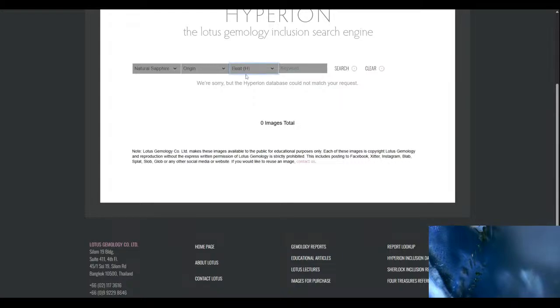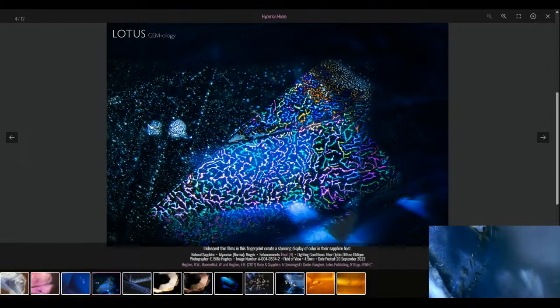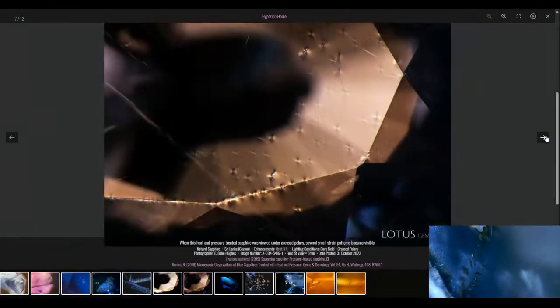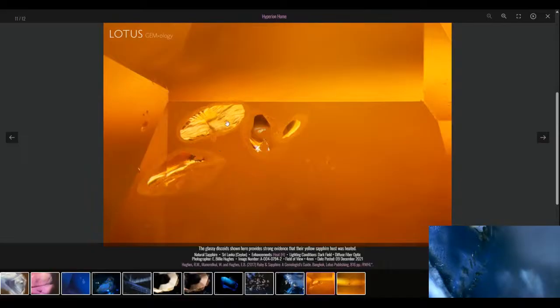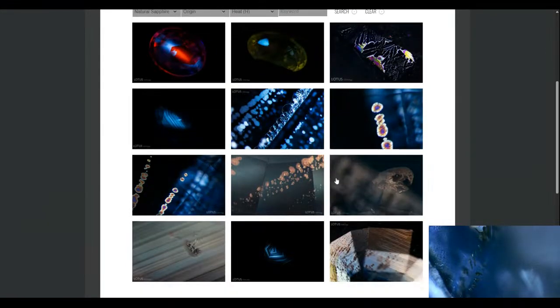Take a look at more. There's not more heat, just heated sapphires. Iridescent thin film. Interesting. I would have thought this is unheated on first sight. It's pretty easy to identify these halos once you get used to it. Especially those.